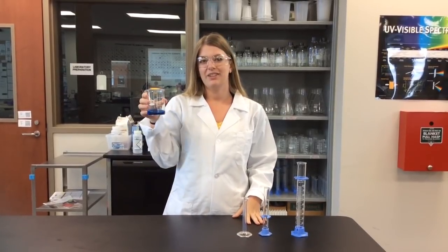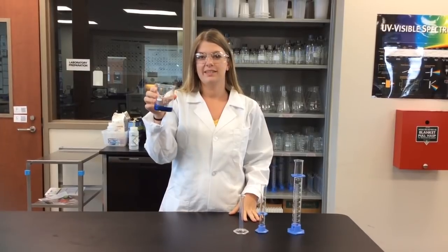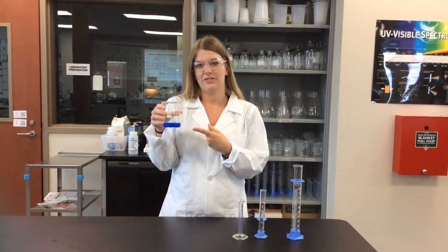So this is a 250 milliliter beaker. This does not measure liquids, you just use it to hold things, like this solution for example.